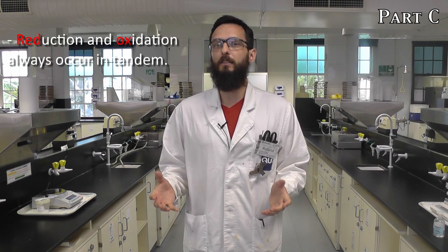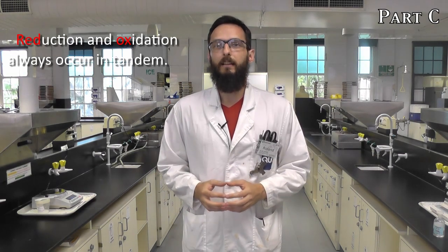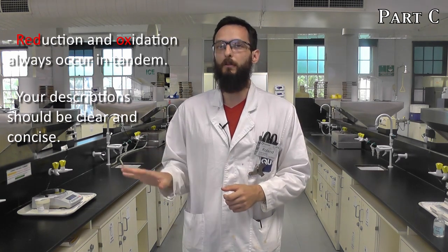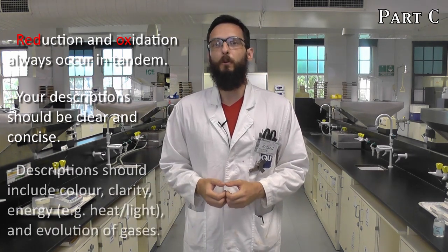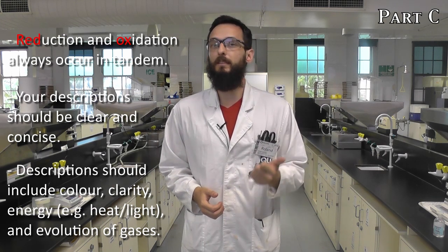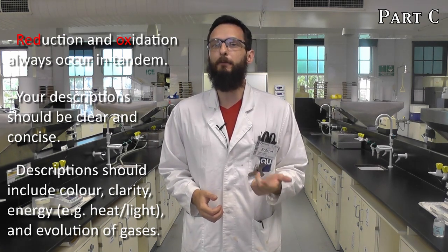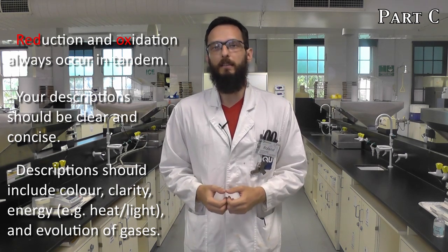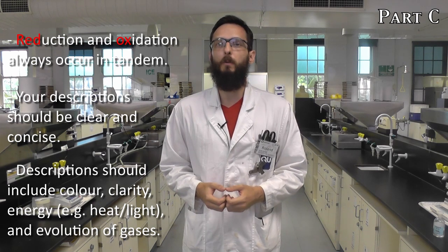In part C, we'll be looking at some redox reactions. Redox is a shortening of the words reduction and oxidation, and you can't have one without the other. At the start, your demonstrator will show you some of the reactions, and then you'll try your hand at your own. It's important when you're observing all of these reactions that you take note of all of your observations. This includes color changes, clarity, any effervescence, which you may observe as bubbling, as well as heat. All of these observations may be useful in determining what the reaction is that you're observing.